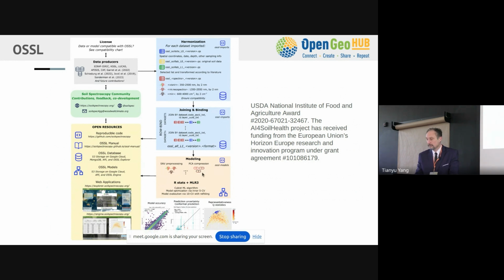This is when we published the paper. Now this is also changing to autoencoders and doing a bit more complex compression of the bands. And then we do fitting of the models. And at the moment it is the machine learning framework in R called MLR3.